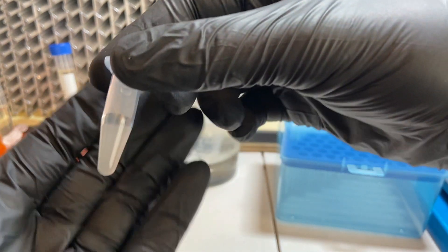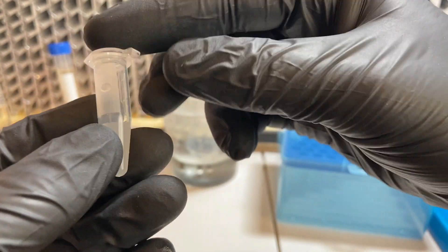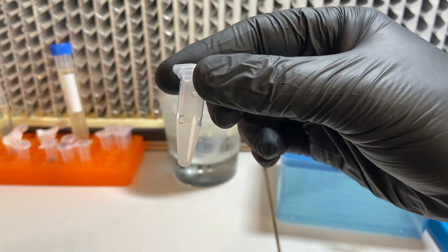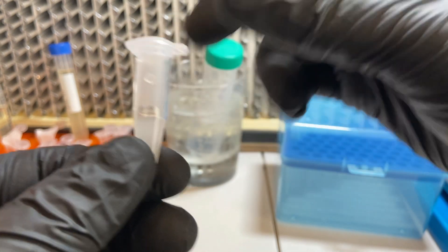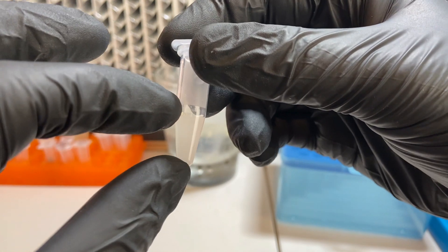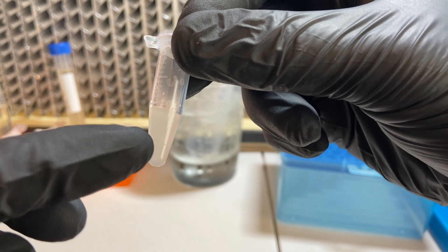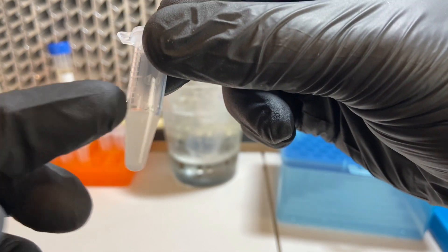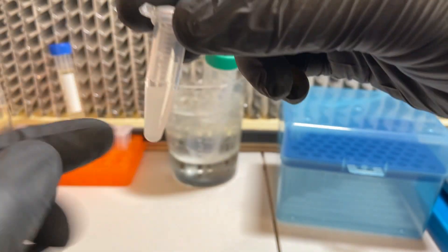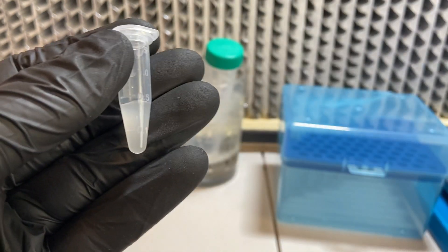Here is the final resuspension of the bacteria I've scraped off the plate. The protocol calls for a final resuspension of 40 microliters, which would go directly into the electroporation cuvette. But because I suspect I've been using too high a concentration of bacterial cells, I diluted this by a factor of 10. So instead of a very strong concentration, I now have a 10x dilution and I can just draw off 40 microliters and try that.